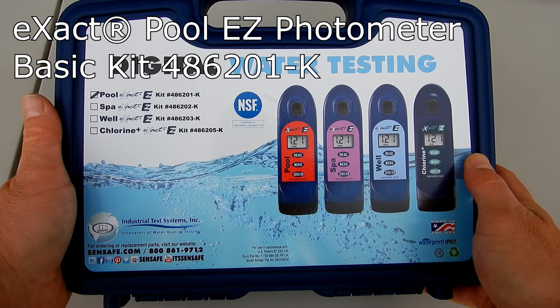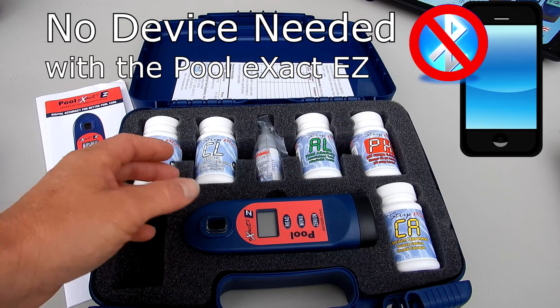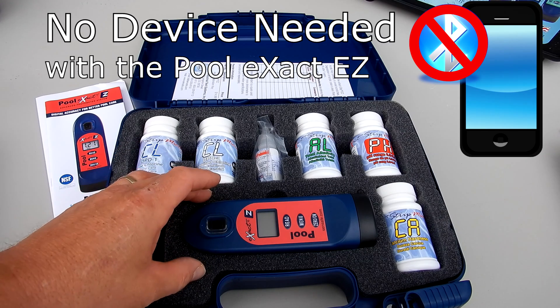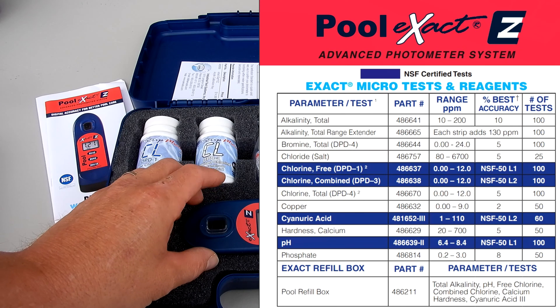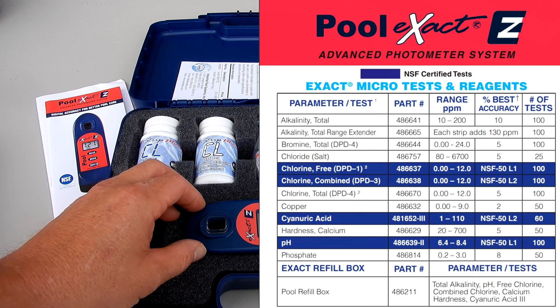This is the exact pool easy photometer basic kit, 486201-K. The exact pool doesn't use any device with a Bluetooth connection. It has 10 pre-programmed test factors: total alkalinity, calcium hardness, chloride or salt, free chlorine, combined chlorine, total chlorine, copper, cyanuric acid, pH, and phosphate.